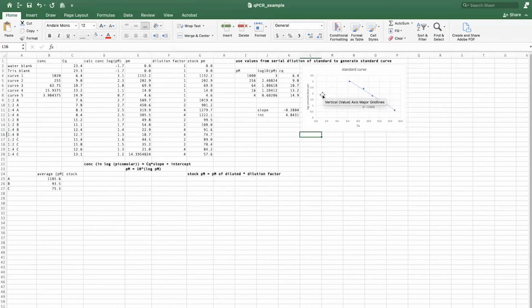Axis of the y-axis so that it's actually going to look like a line. If you're doing these divisions where you're going to have a large range of values, like 4 to 1,000, if I were to plot 4 to 1,000, the 4 and the 16 and the 64 would all get squished down here, and then you have 250, and then you have 1,000 up here. Your data would be really squished down, and the other would look like an outlier, and you couldn't really tell what was going on.